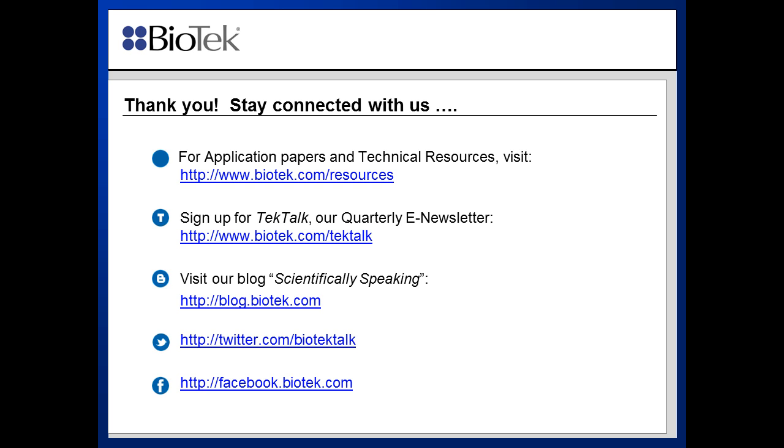One of the questions was, can neurons be used? The answer is yes. There's some particularly interesting work being done using aligned electrospun fibers on 3D models for neurons particularly. That's applicable. There was a question on how the mitochondrial concentrations shown earlier relate to the actual amount of mitochondria in the well. The simplest way to answer that, I suppose, is to say that our assay volumes are typically about 100 to 150 microliters, so essentially 10 times less than the mg per mil values that you'll receive on your slides.